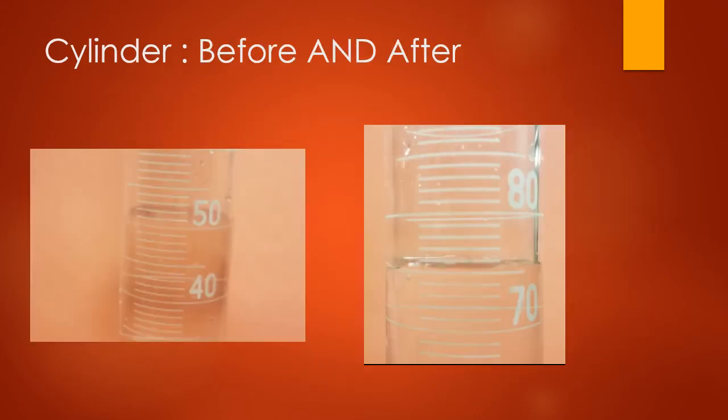here you want to record, make sure you're going out one decimal place, the new level of the water. Here's another picture with a piece of paper behind those two water levels. If you were having trouble seeing, especially in the after picture, I feel like it's a little clearer with the paper behind it. So this second picture here is the after. You might be able to see it and record more accurately using this picture. So whichever one you can see more clearly, use that one.